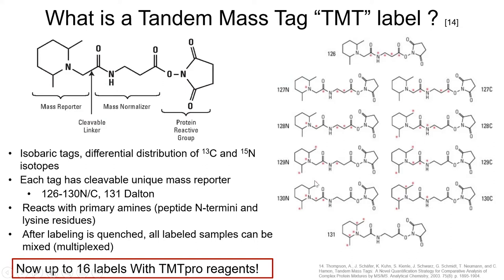And so these can I make a comment real quick, Caitlin? Of course. Yeah, what's cool about these is that in the very high resolution in Orbitraps that Dr. Dowd talked about in her lecture on Monday, the resolution is so high that the instrument is actually able to measure the difference between a heavy isotope of nitrogen and a heavy isotope of carbon, which is a very small mass difference.